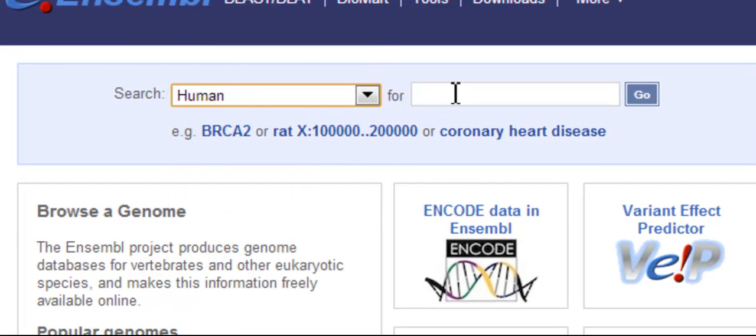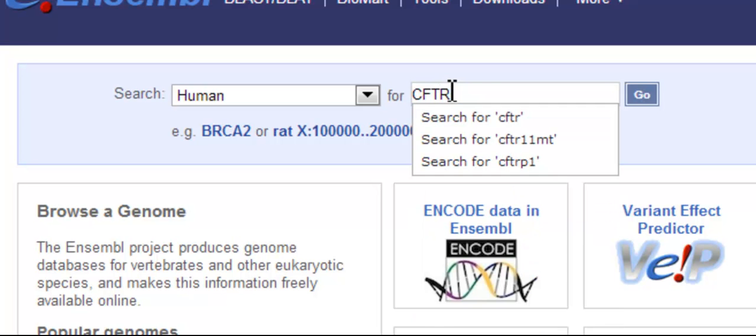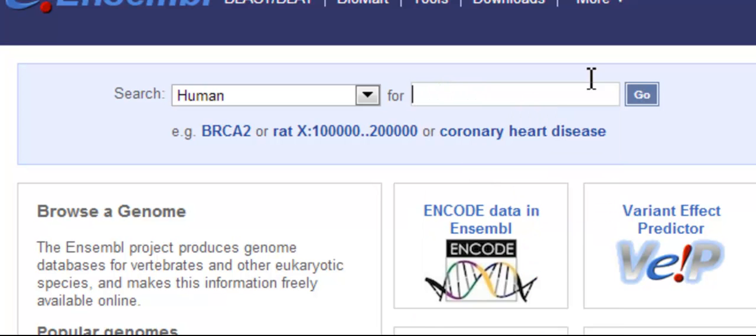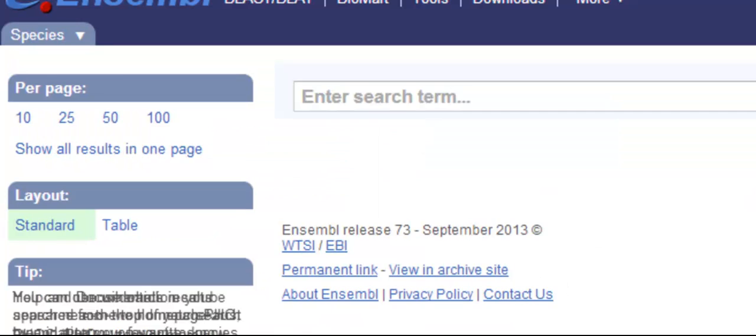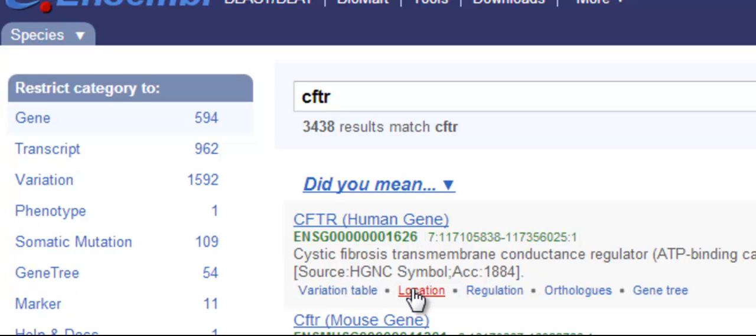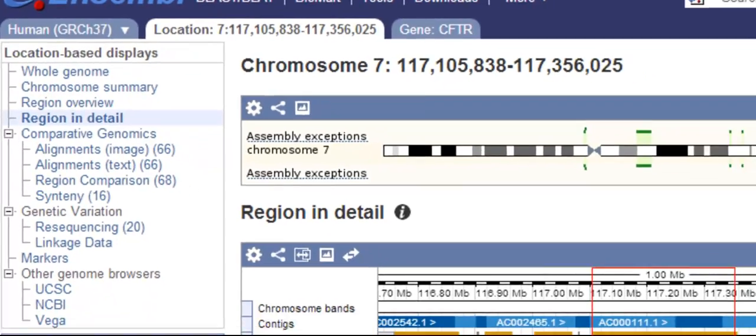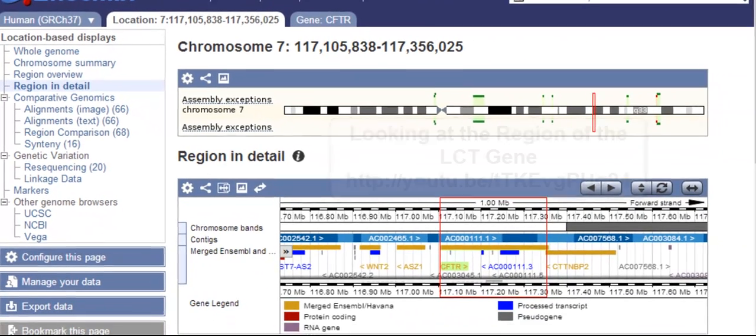I'll choose human and then type in CFTR and search for it. I could click on the gene, but I'm more interested in the genomic location, so I'll click on that. This brings me to the region in detail view. Find out more about it in this video.